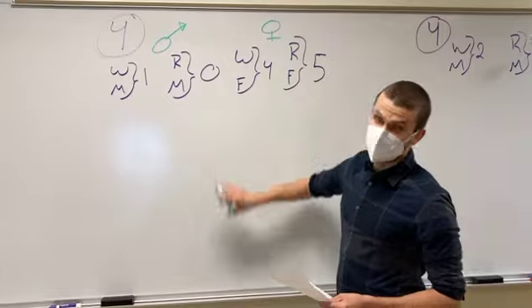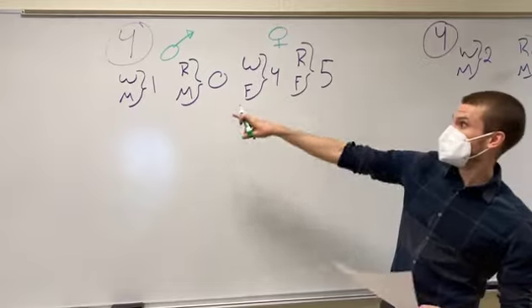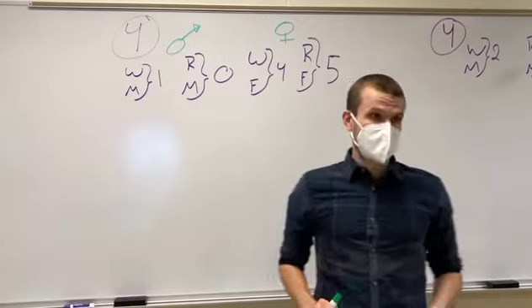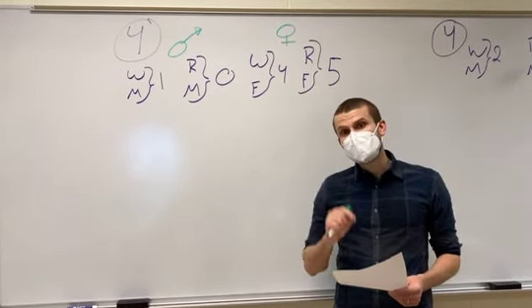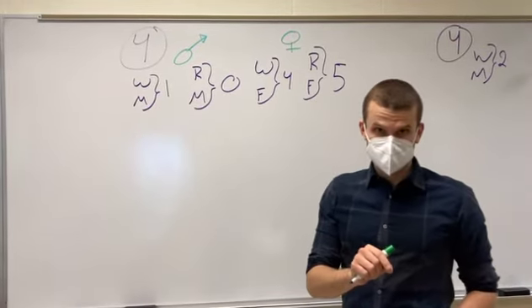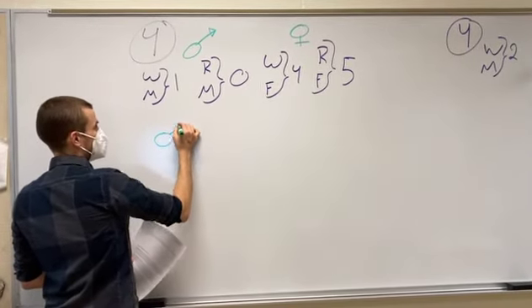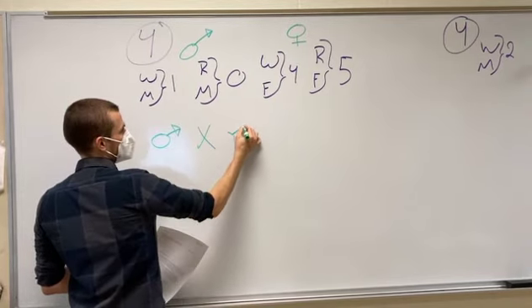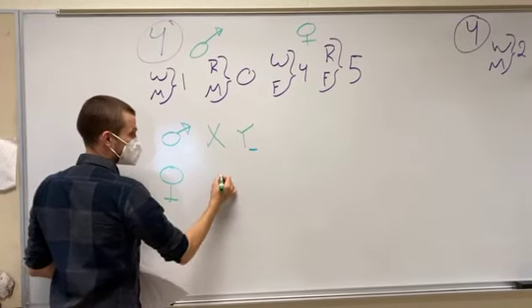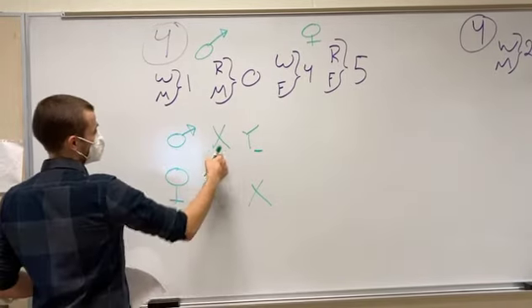All right, so here we are with our fourth station where we got our 2 sets of data, because the first time, random sampling, we only pulled 1 male, 9 females. Now, what do we know about this? First and foremost, from our fly manual, you know that eye color is sex-linked. You also know that white eyes are a mutation. And we know that in fruit flies, males are XY, and Y has no allele for eye color, and females are XX. So males are going to be hemizygous, only 1 allele.